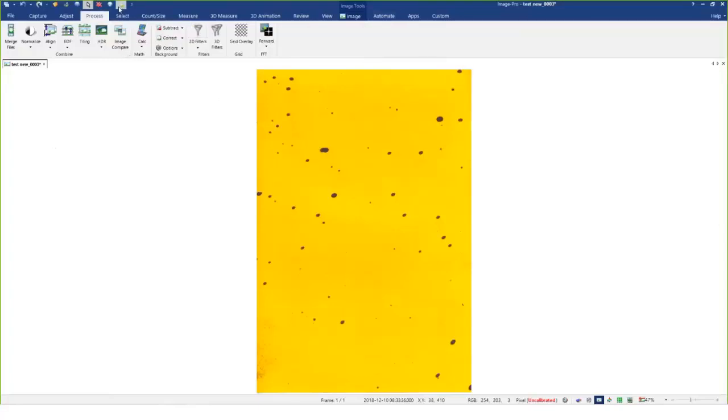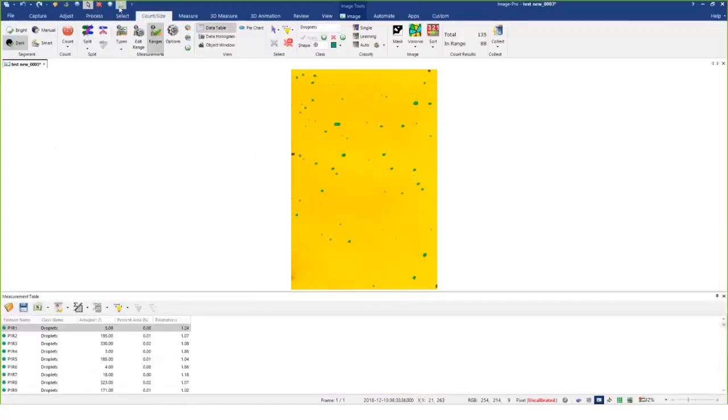What's nice in the Quick Access ribbon, I can just simply run the macro right from there, and it will do everything. So if you're doing the same things over and over again, or a series of operations or a series of macros, this will save a lot of time and effort.